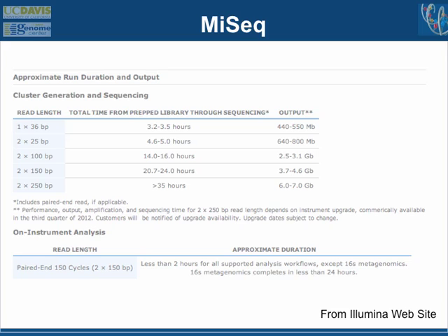And you might want, say, 10,000 sequences from each. So if you're getting hundreds of millions of sequences in a run and all you need is 10,000 from each of your samples, you have to basically figure out a way to pool together thousands of samples into a single run and tag each of those with a little barcode and sort them out afterwards.